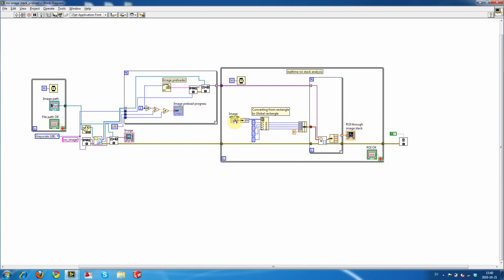The region of interest, like in the previous example, this is all similar material. So we have changing the rectangle, which changes the region at which we look at with the light bulb, and then it reads out this image stack, which is being represented as a graph. And we have a little timer delay here so that it doesn't try to run too fast.